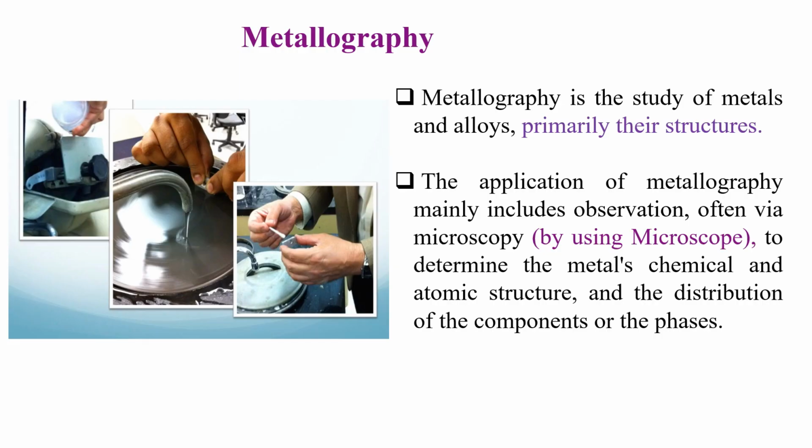In this video, we are going to learn about metallography. Before starting, I would like to tell you that we have so many times used the word structure related to the material, that is, material structure or crystal structure. In previous videos we have seen the various types of crystal structure and lattice. What is meant by metallography is a very important term, and for studying or identifying the structure of the material, metallography plays a very important role.